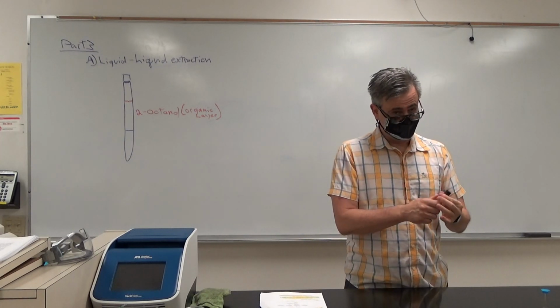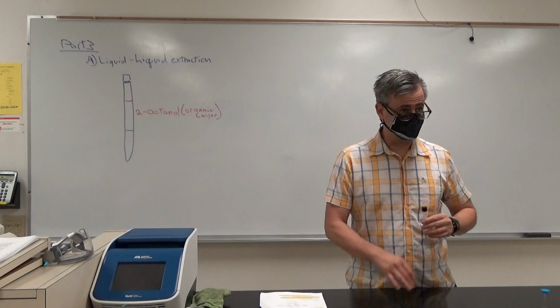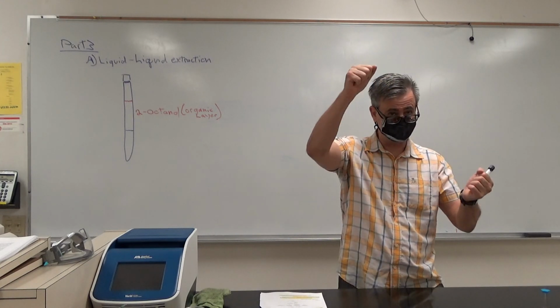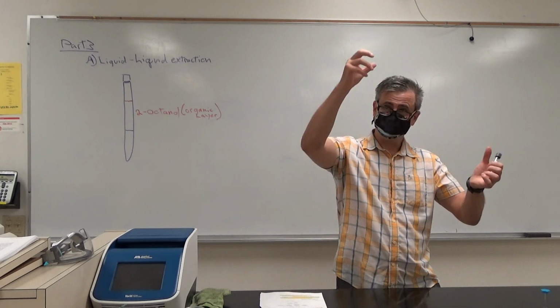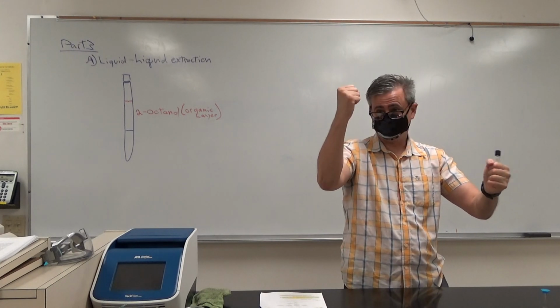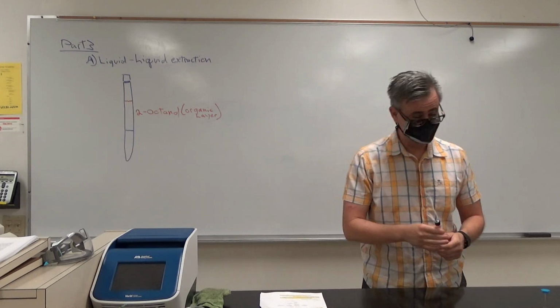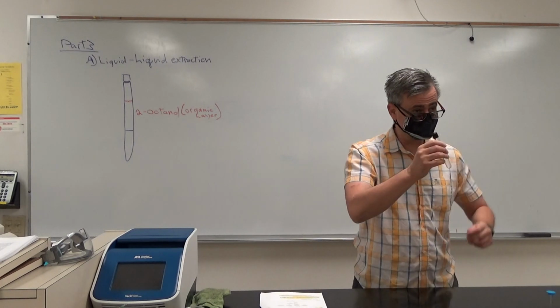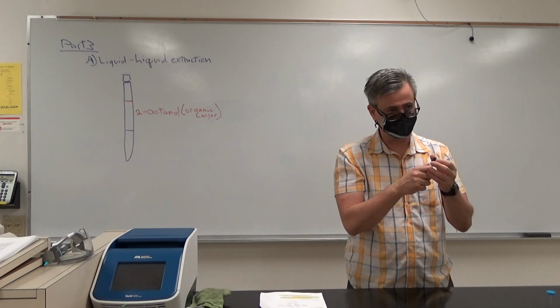That makes sense. Okay. And then when you do an extraction, an important rule is that the first shake is gentle. Okay. There are things that can generate gas. One time I did an extraction with a big piece of glassware about this big, and I forgot that it rolled. I didn't realize there was an impurity in there that caused a lot of gas. I had the top in one hand and the bottom in the other, and I shook it, and it exploded. I had the top little piece of glass, and I had the bottom little piece of glass, and I was drenched in chemicals. So anyway, not my finest moment, whenever you do an extraction, that first shake is a gentle little shake, and then you vent it, like if you were opening up a brand new soda, okay? So that any gas pressure can be released.